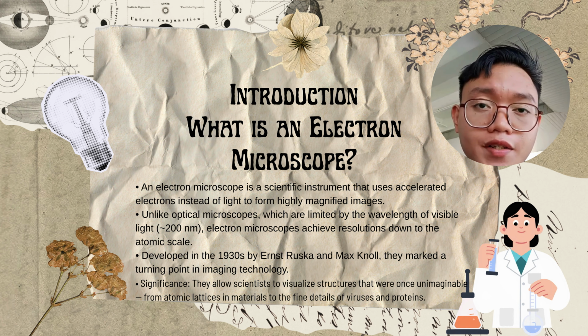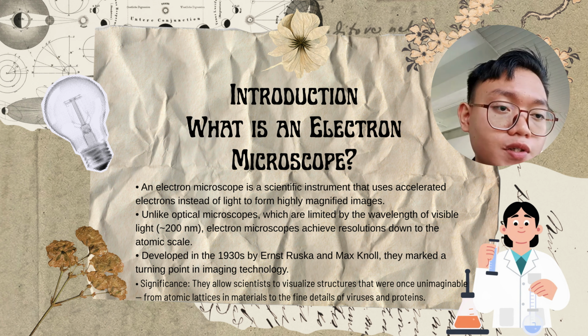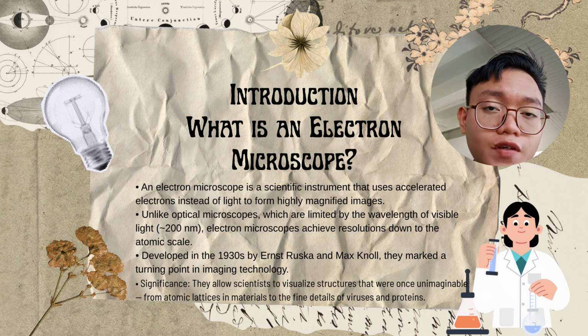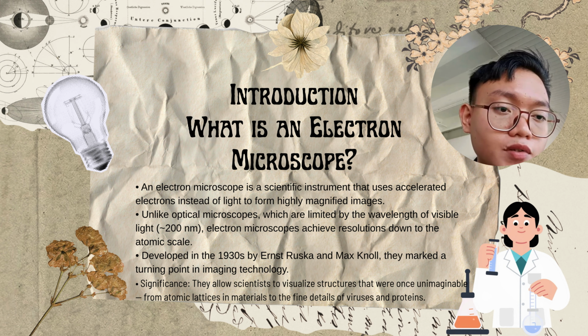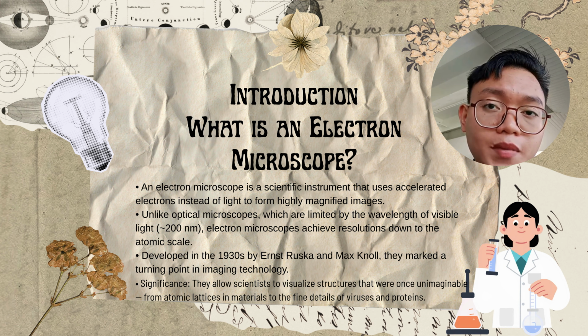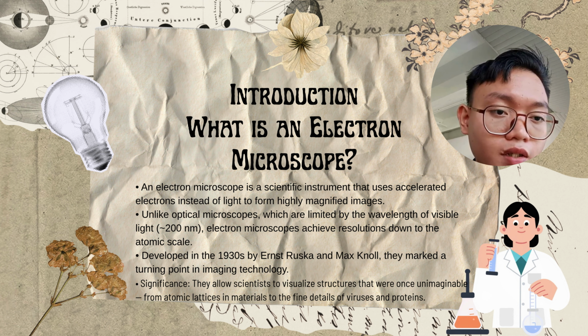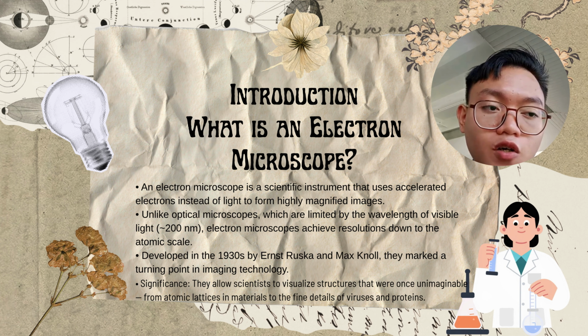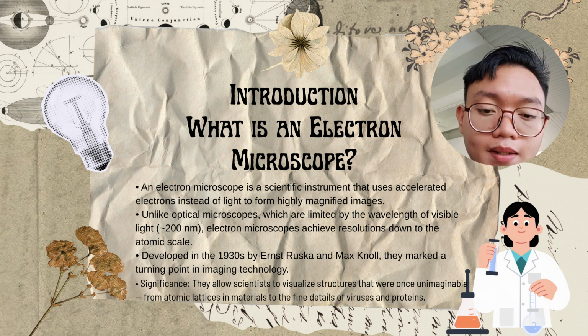It was developed in the 1930s by Ernst Ruska and Max Knoll. Due to the invention of the electron microscope, scientists are able to visualize structures that were once unimaginable, such as atomic lattices in materials to the finest detail of viruses and proteins.